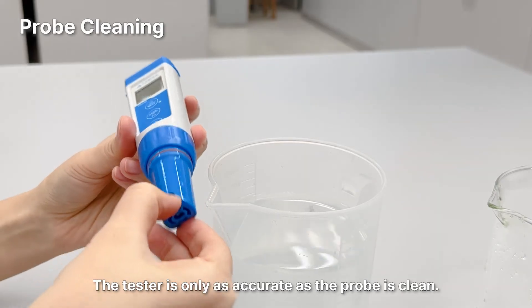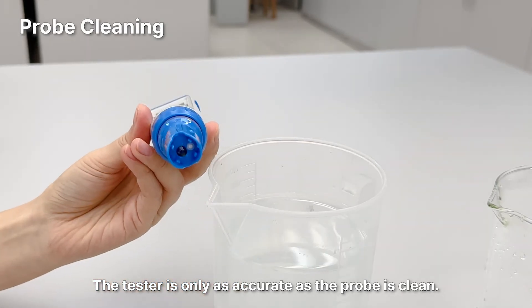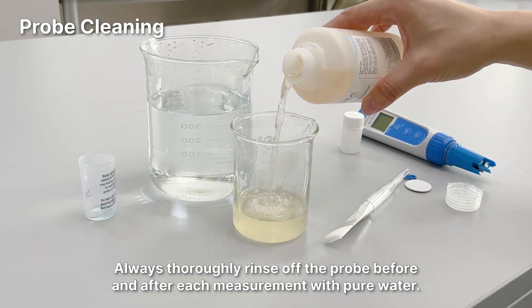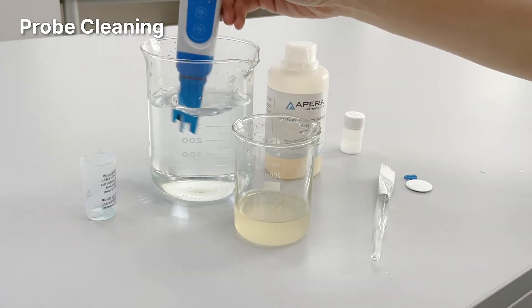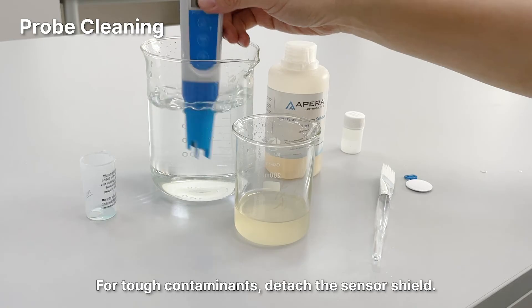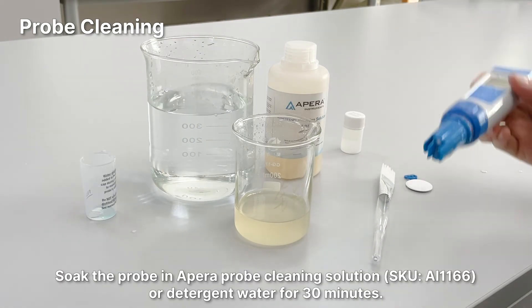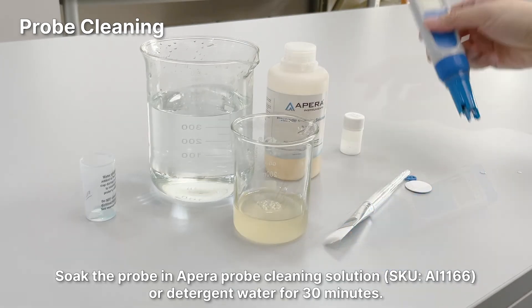The tester is only as accurate as the probe is clean. Always thoroughly rinse off the probe before and after each measurement with pure water. For tough contaminants, detach the sensor shield and soak the probe in the Apera probe cleaning solution or detergent water for 30 minutes.